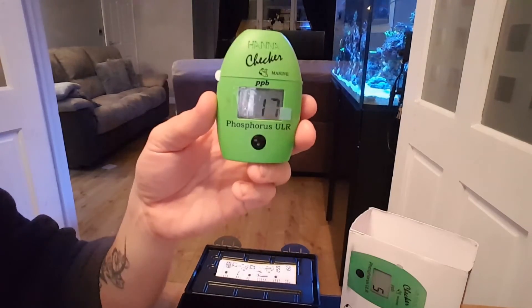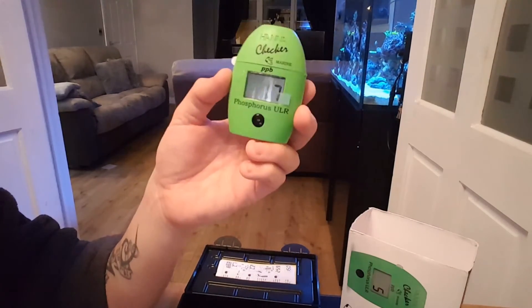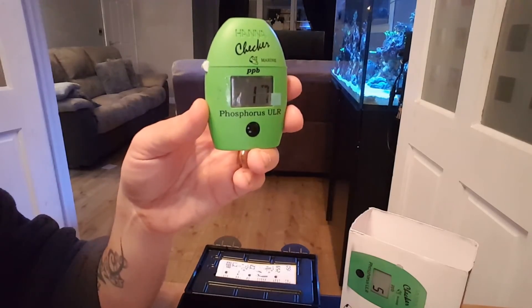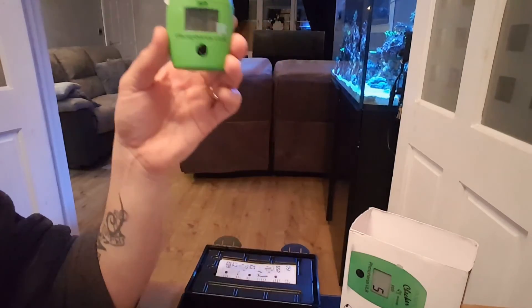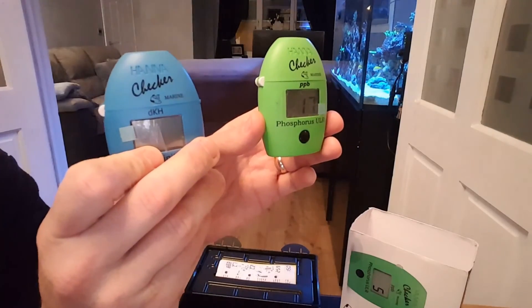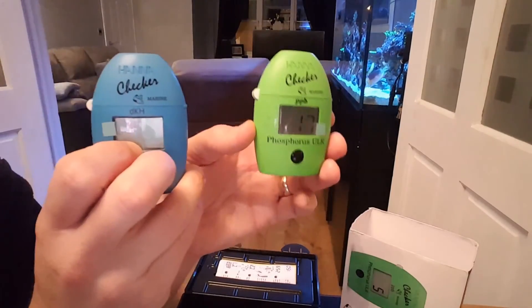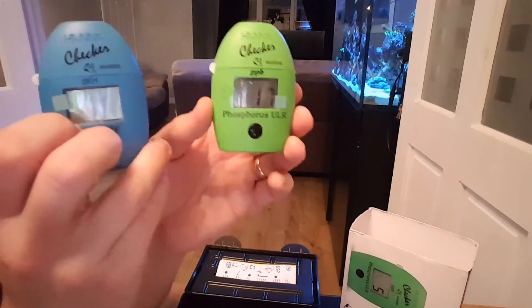It's very simple to use. I know you have to wait three minutes, but other tests you're waiting six or seven. It's very accurate and you can't go wrong with a digital reading, so highly recommended. This and the alkalinity one — or DKH — these two I recommend. I don't recommend the others because they're too fiddly and too complicated. But these two, definitely recommended.